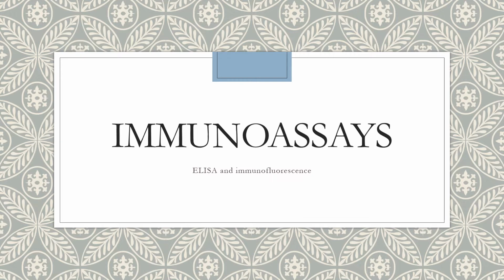Okay, so we're going to talk about two methods today. We're going to talk about ELISA, which stands for enzyme-linked immunosorbent assay. Here we have antigen and antibodies that are labeled with enzymes, and we're also going to talk about immunofluorescence, so stay tuned.